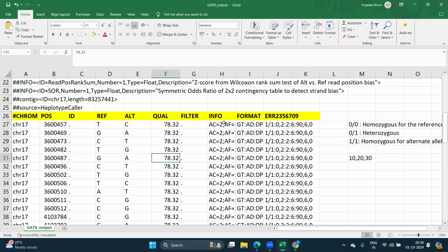Now here, if you see in this particular Excel file, we are just having the variation information, right? You are having the genotype information, the location, coordinates, chromosomal location, but you are not having any extra information about your variation. If this variation occurs, what kind of effect is it going to have? That extra information, or the biological impact factor, you are not having here, right?